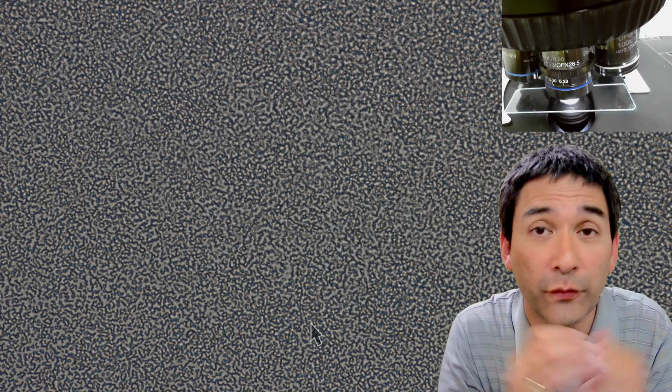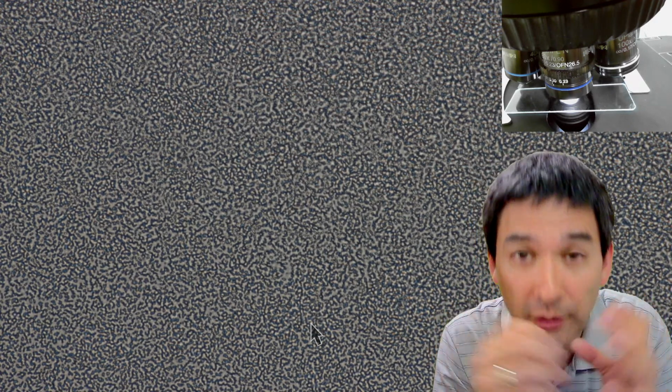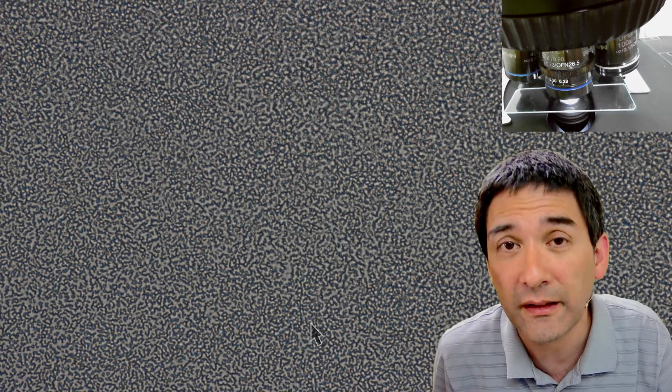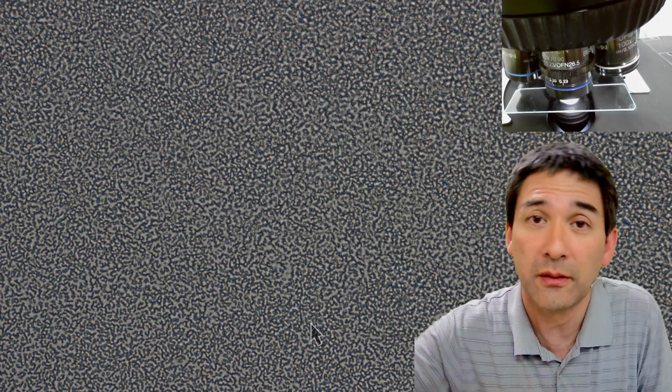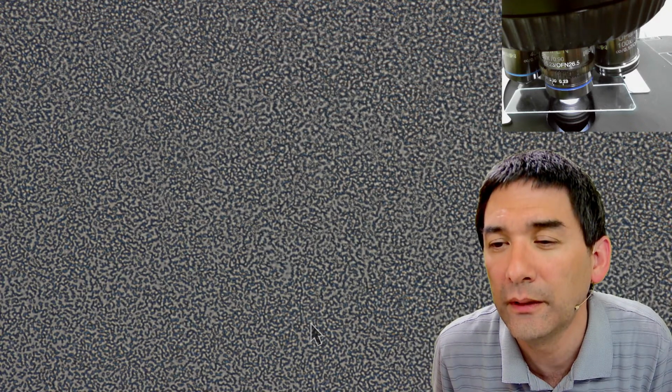The correct height is, of course, very important. A proper chair is important. Another option you might want to consider is to maybe not look through the microscope, but to connect the camera and do some microscopy using a monitor, for example. That is also something that some people are using. There are a variety of things, but an important thing is that the microscope has the correct height, and if it is too low, then put something under the microscope to increase the height.